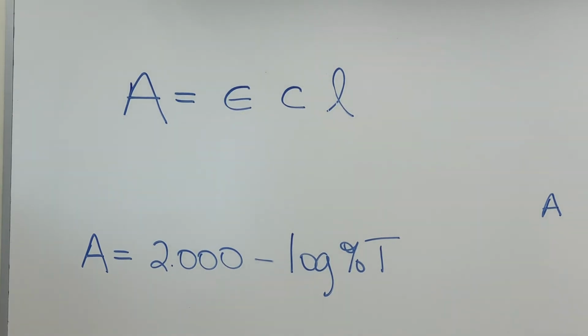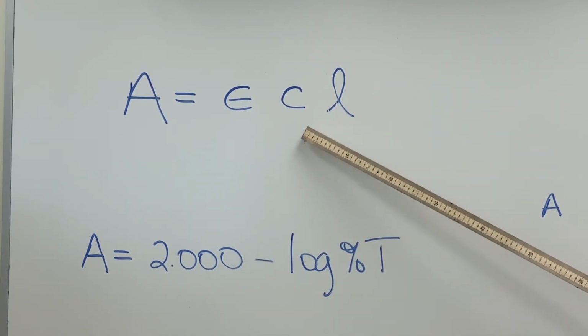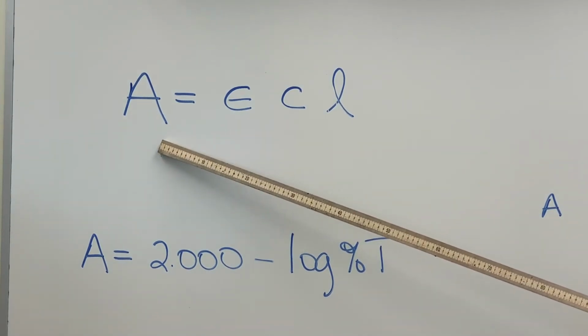The molar extinction coefficient is really the strength of the substance, especially if it's colored. This is a very important tool for dye chemists when they're looking at the strength of the dye. If it has a higher molar extinction coefficient, then typically you don't need much to impart a color with that particular substance. Polarity certainly can affect that. I should also say that solvent and temperature can also affect whatever the absorbance happens to be.